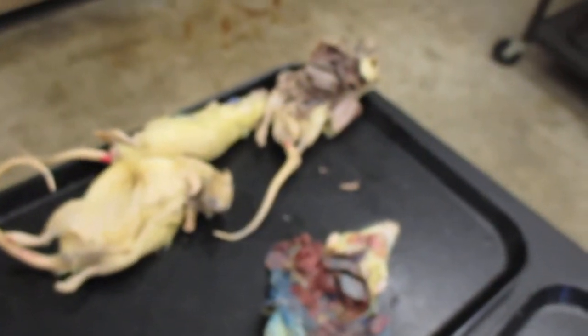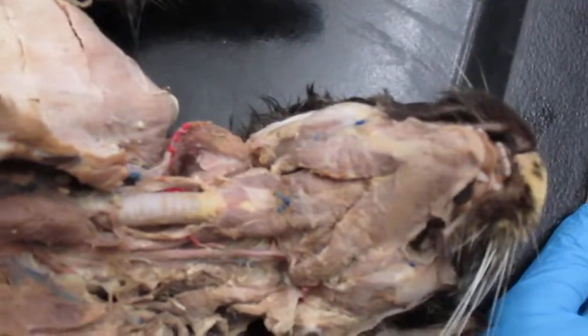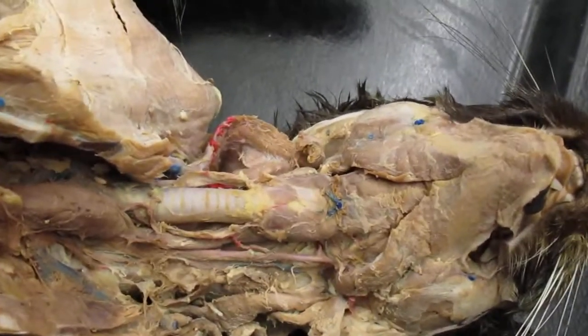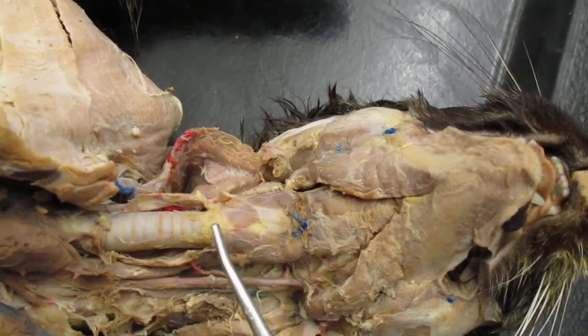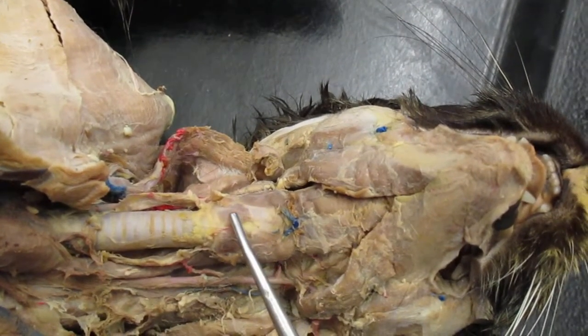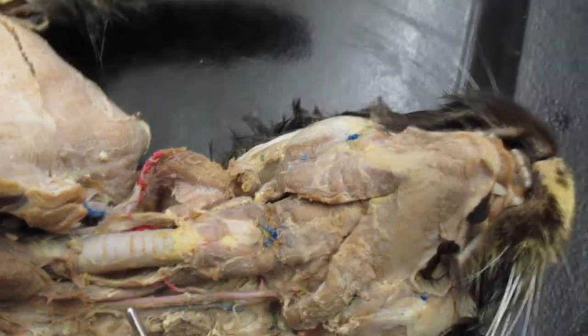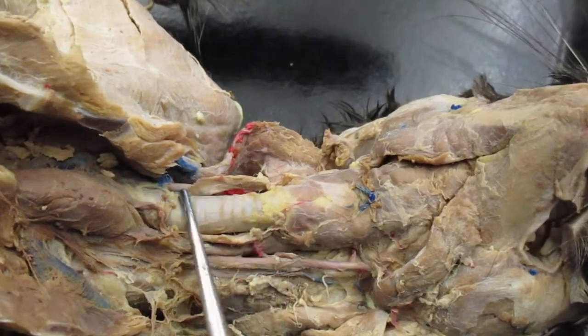Next, we have the thyroid gland, and we'll go over to the cat right here. So, if you look right here, this is the cat's head and neck region. We have the larynx right here. We have the cricothyroideus muscle right here. And then right here, we have the trachea, or windpipe.